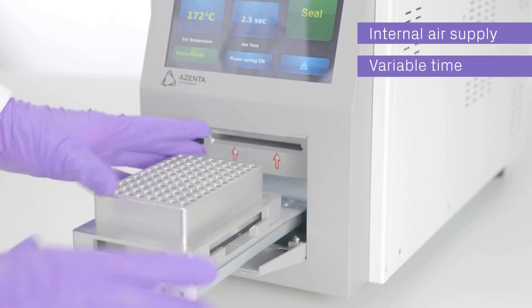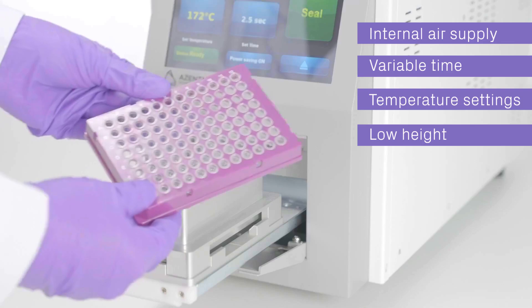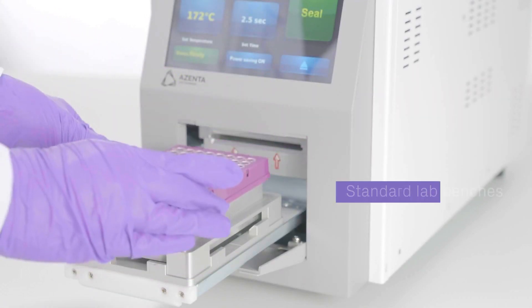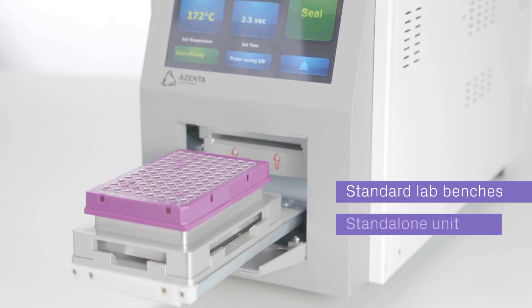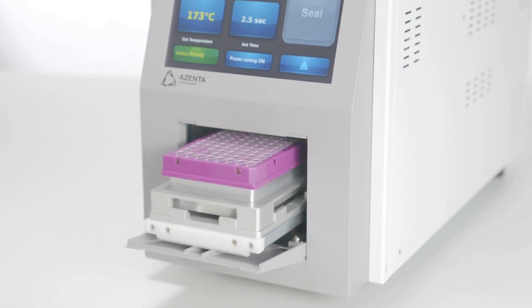With its internal air supply, variable time and temperature settings, and low height, the automated heat roll sealer enables you to design the workflow you need. This provides flexibility to use the instrument on standard lab benches, as an efficient standalone unit, or as a plug-and-play sealer-compatible component in a fully integrated robotic setup.